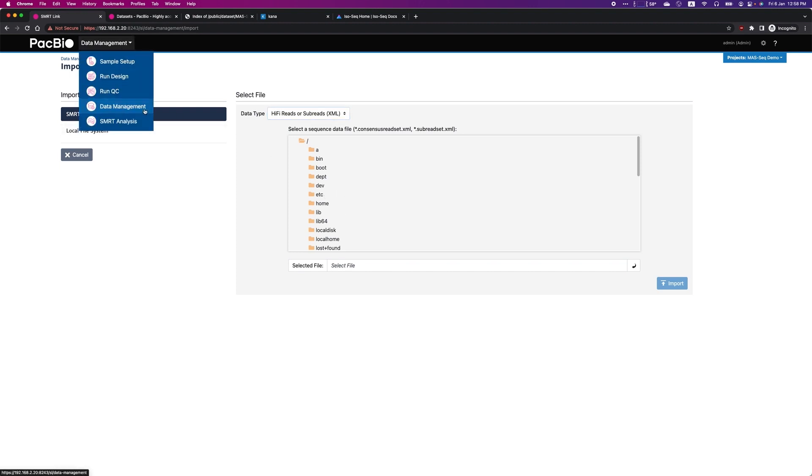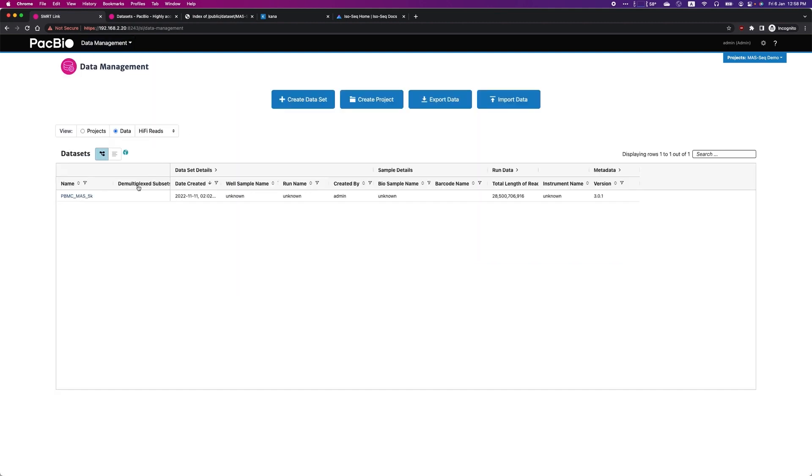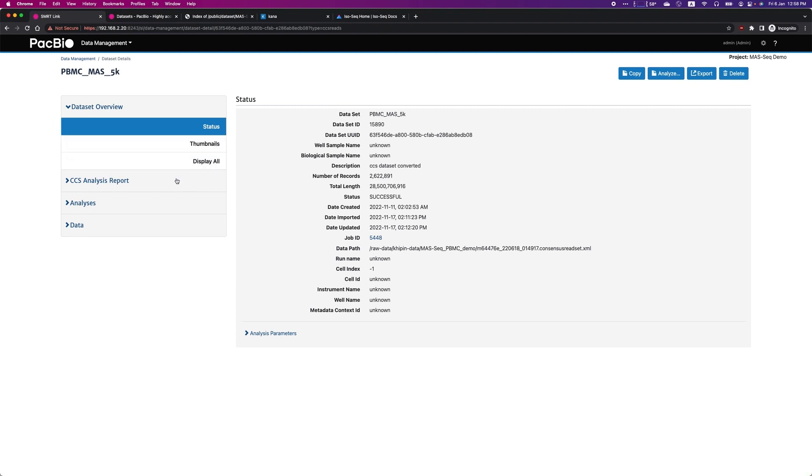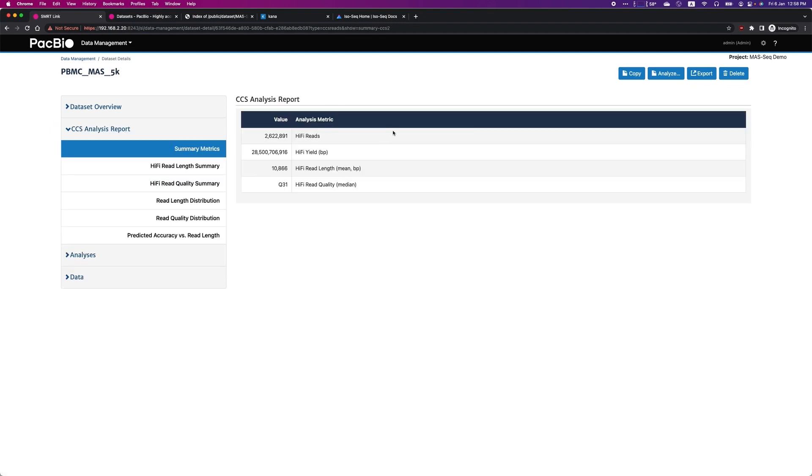After the dataset is imported, you can go to Data Management and review the run matrix of the sequencing run. Here, you can see that this dataset contains 2.6 million HiFi reads from HiFi sequencing.